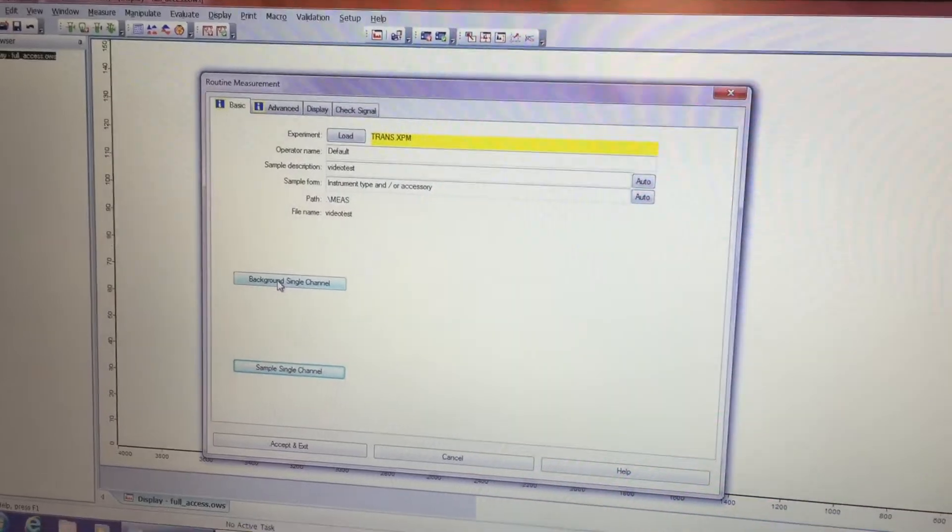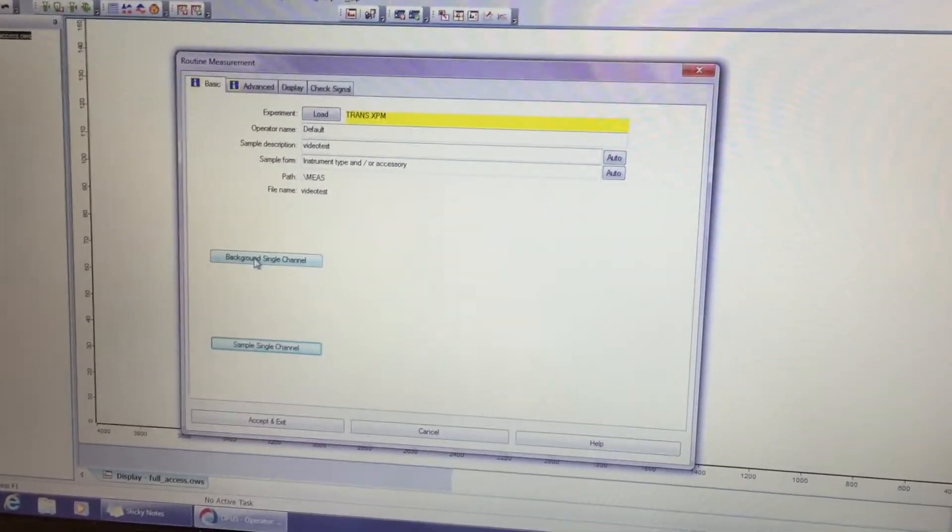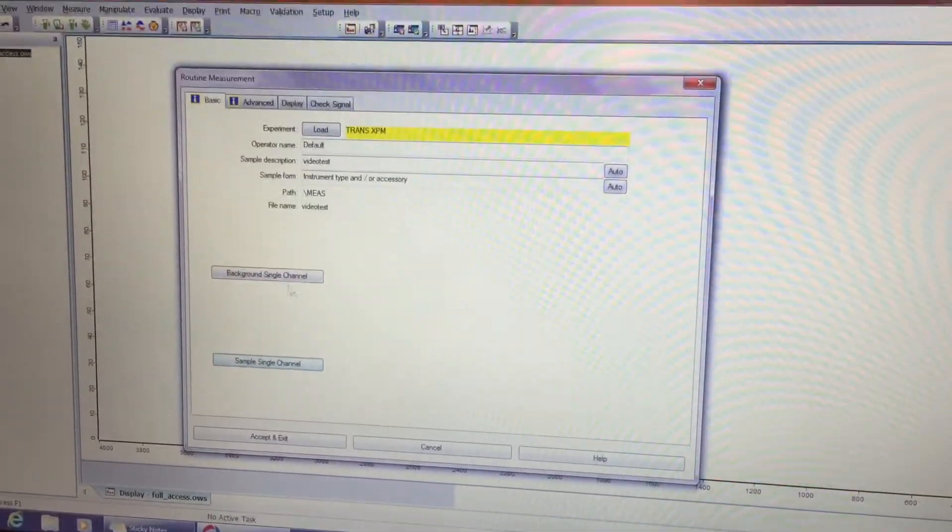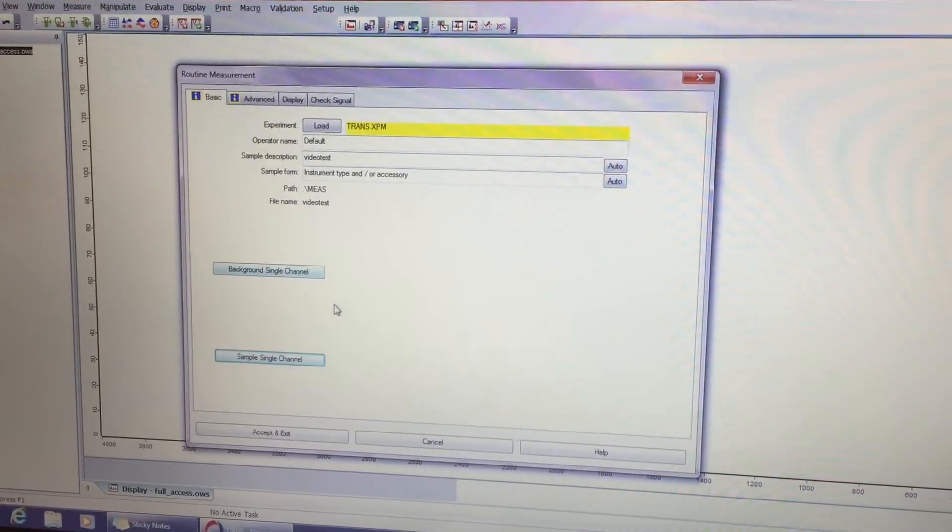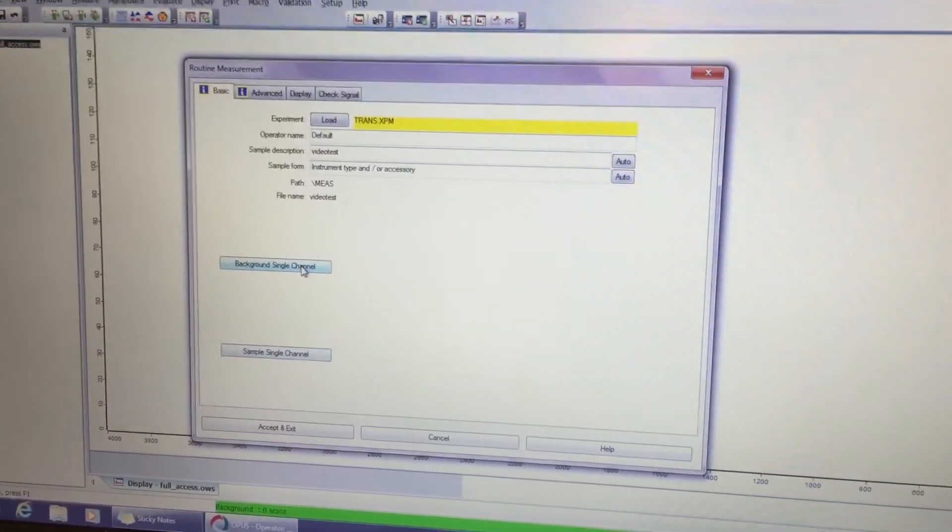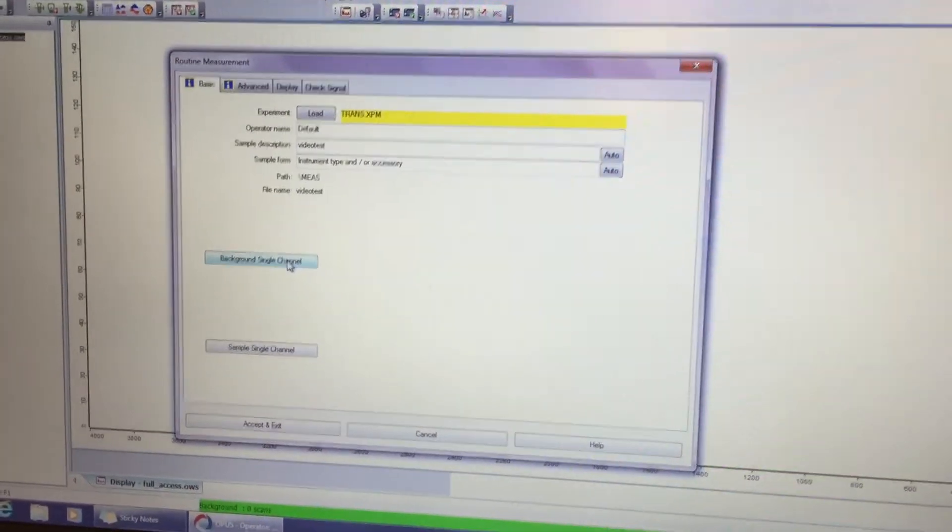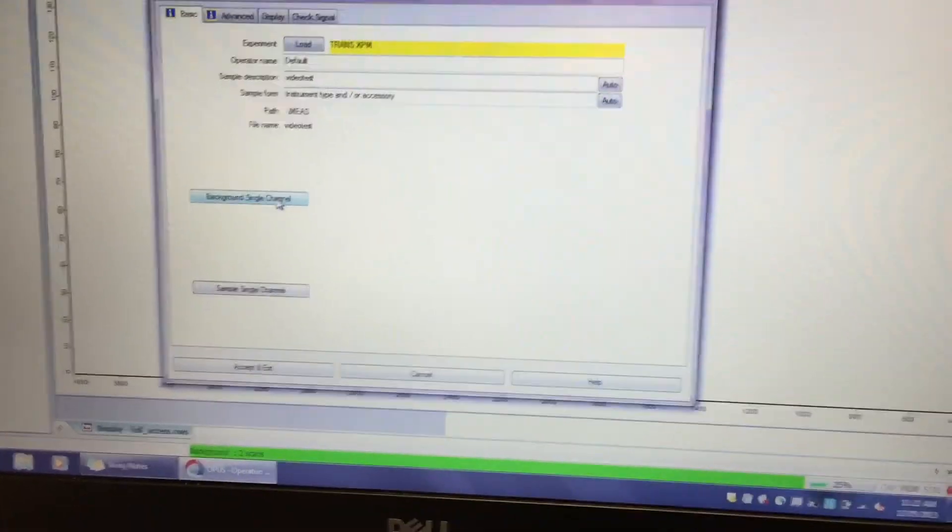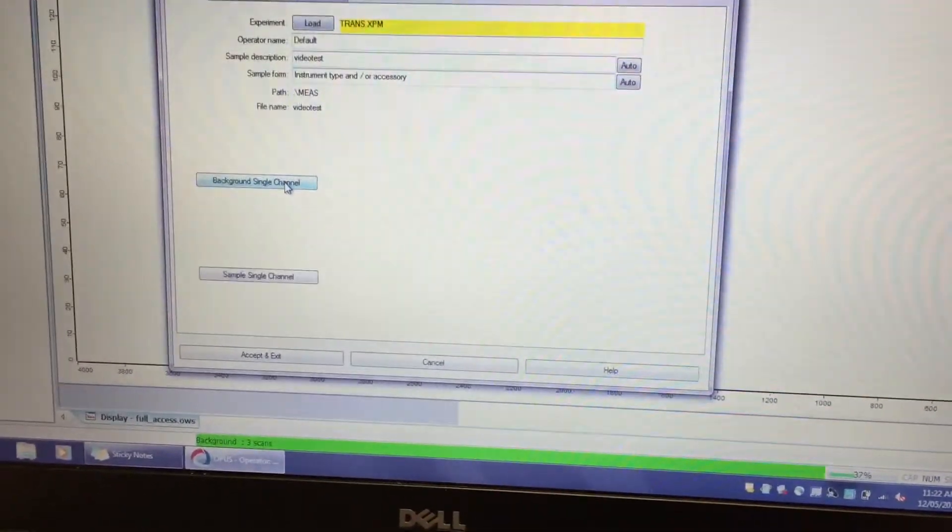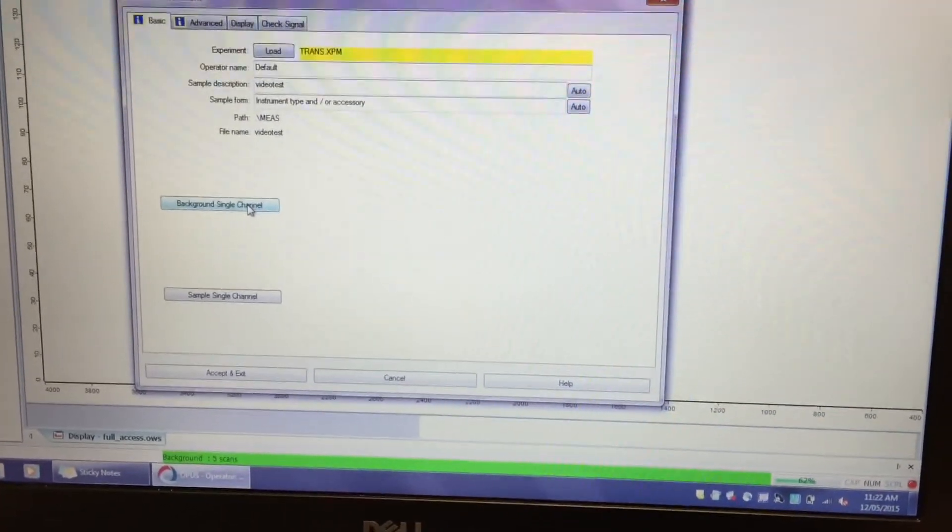Now let's do a background single channel. If I press on background here, it's going to take a background. So right down here there's a green bar that tells you it's doing something. It's at 3 scans now, so it's going to do 8 scans. It has finished its 8 scans.